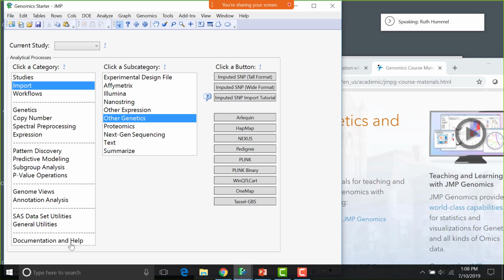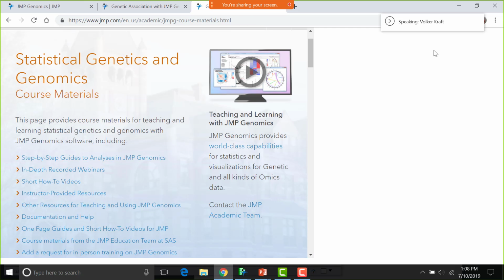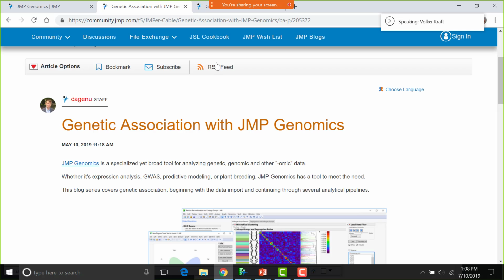Okay, so there are even more questions coming in, and it's very nice to see that some participants seem to be already JMP or Genomics users. Great. And they also started to share some tips and best practices. So really, thanks a lot for engaging with us and for joining us today. Maybe some people asked about the blog. Maybe last but not least, we take this pointer and show you where to find the Genomics.